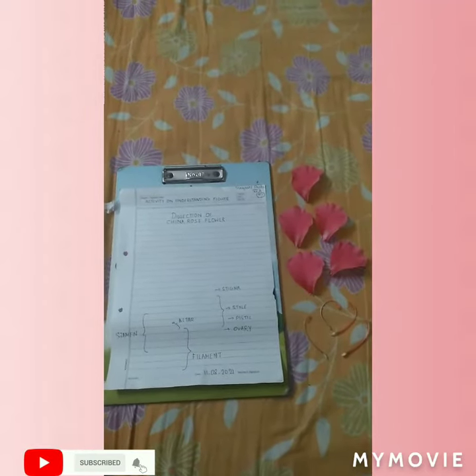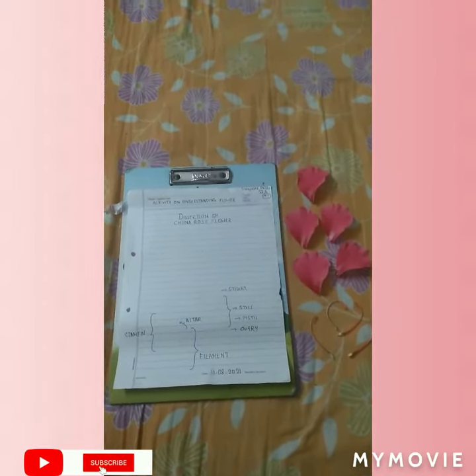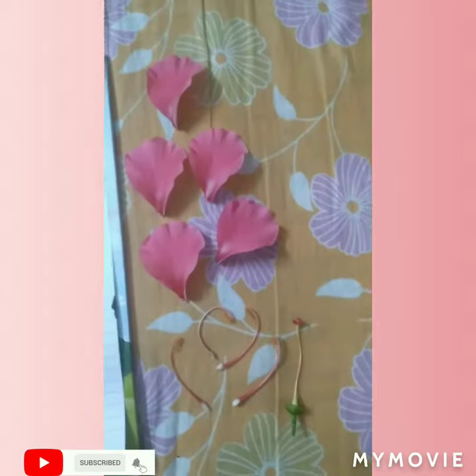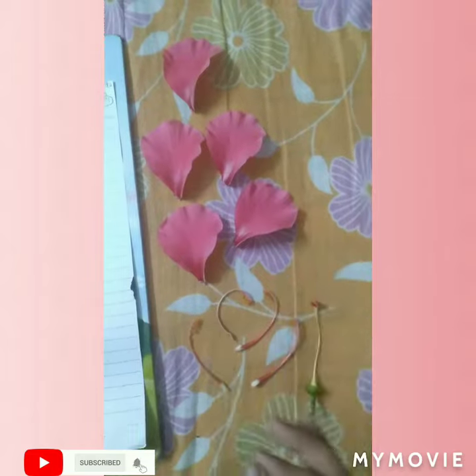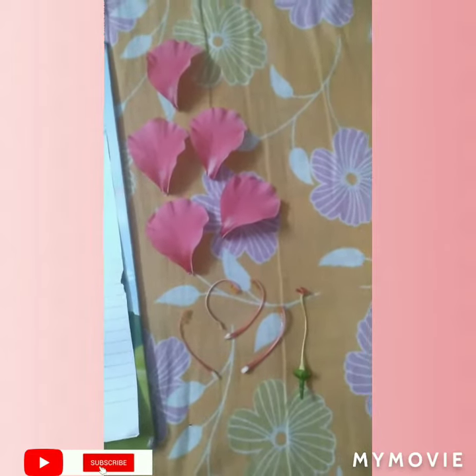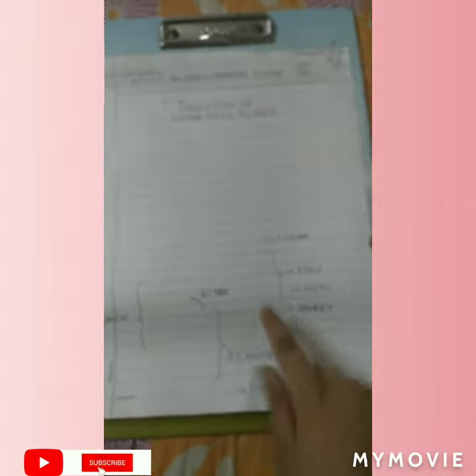I am Shreyashi Parida and today in this video I am going to show you the dissection of a China rose flower. These are the different parts that I have cut from a normal hibiscus. You can get it from your garden only. So these are the different parts I have cut. You can see on the paper also I have added different parts.